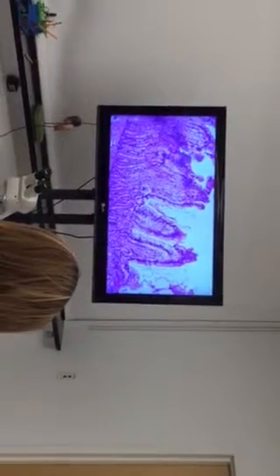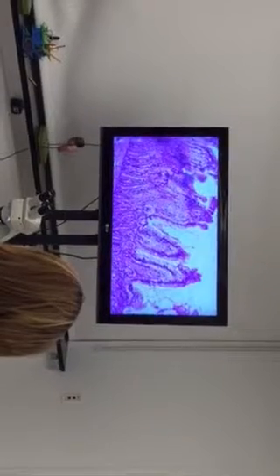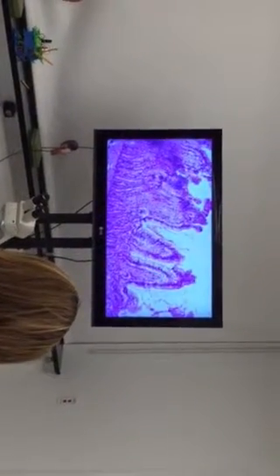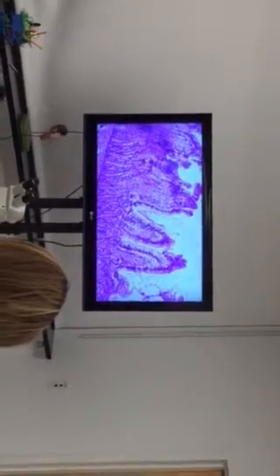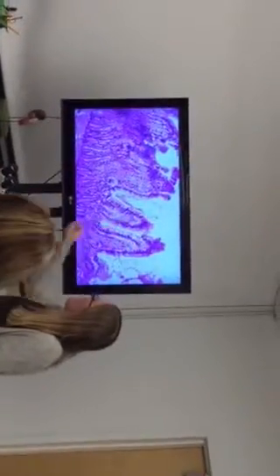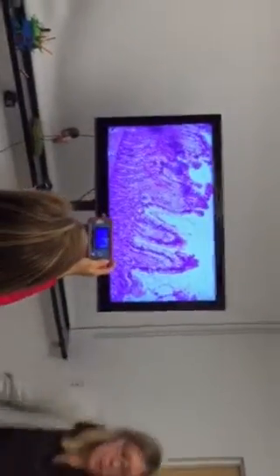Okay. What's underneath, just deep to the simple columnar? That connective tissue is always called the lamina propria. That's where blood vessels and lymphatic vessels are. That's where the nutrients get sucked into. So this lighter space, that's all lamina propria. Okay? And it continues all the way down to where we're going to find the submucosa.